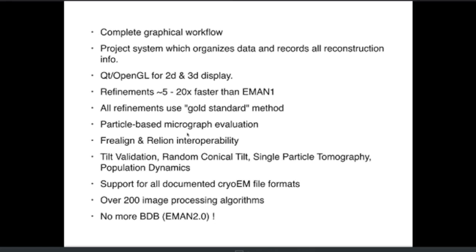We have a nice method for particle-based micrograph evaluation. One of the issues in the field is you get a micrograph. Typically you look at the power spectrum of the micrograph, which gives you some information about the resolution of the information that resides in the micrograph. However, the issue with the micrograph-based approach for evaluating the quality of the images is certain artifacts in the micrograph.